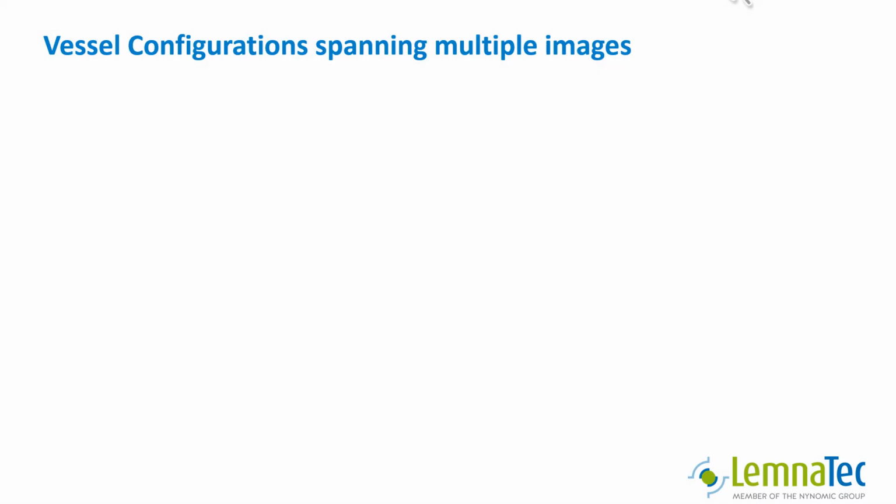If you have no camera with multiple camera positions, then you can skip to the end of the video. We will now discuss vessel configurations for this case. There are basically three scenarios to consider here.